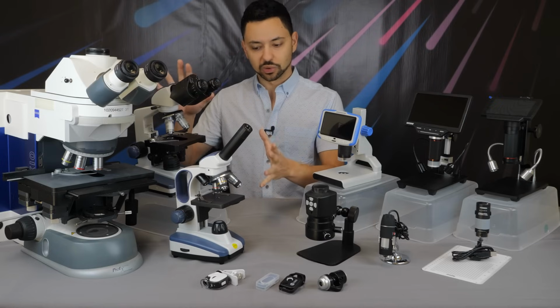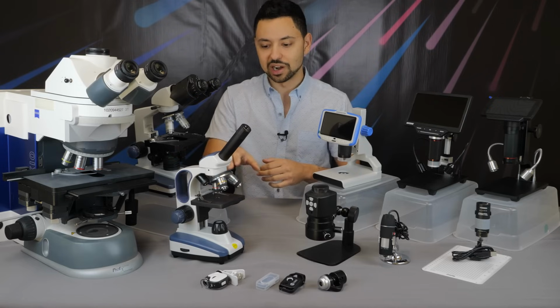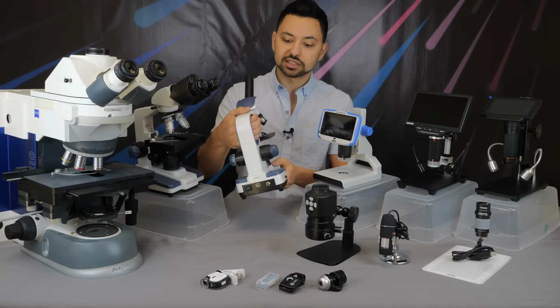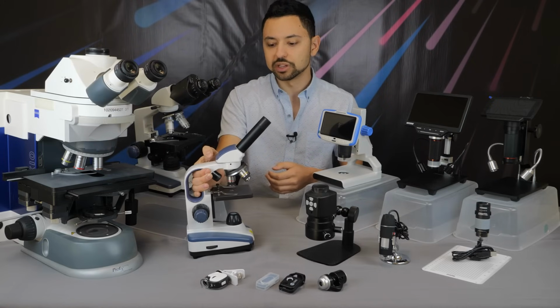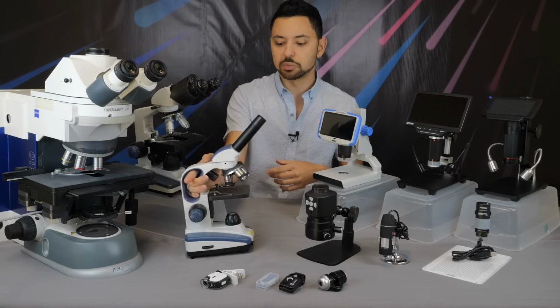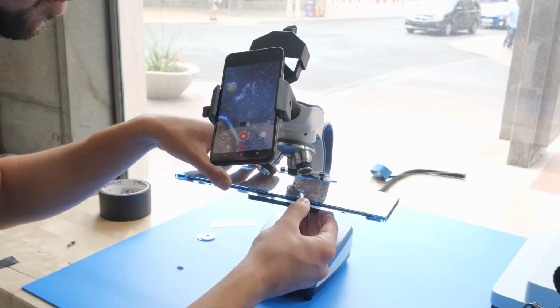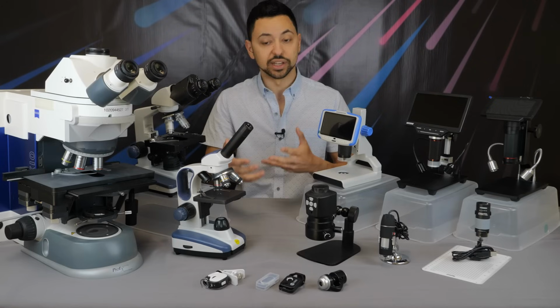So in this category, I'm going to go ahead and give this Swift microscope the best value option. I was pretty impressed with this thing. At $60, they've essentially spent the money in good places, so to speak. So they've cheaped out on certain components. There are things that are just simply missing from this microscope, which you would find in a slightly more expensive microscope. But the most important things, those being image quality of the objectives and a good Z-axis platform, the actual stage itself is quite good on this.